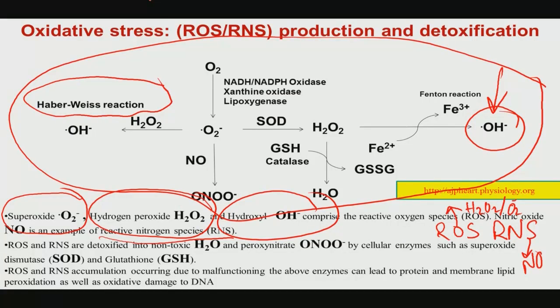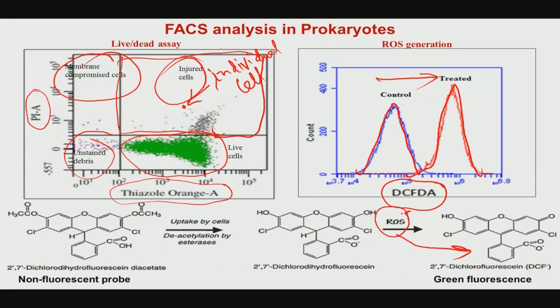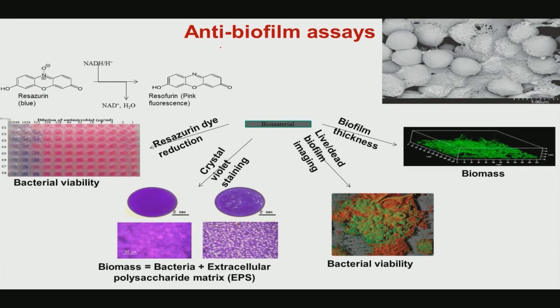Now, to support your rationale or logic, you have to do additional assays to confirm, both qualitatively and quantitatively, that it is indeed because of membrane permeabilization or loss of membrane integrity that the bacteria is being killed in contact with the materials, or is not able to grow once it comes in contact with these materials. And also a more biological or biophysical origin can be reactive oxygen species, and then you need to quantify that ROS using FACS. Now, up to this part it is done. So, then you confirm the antibacterial effect.